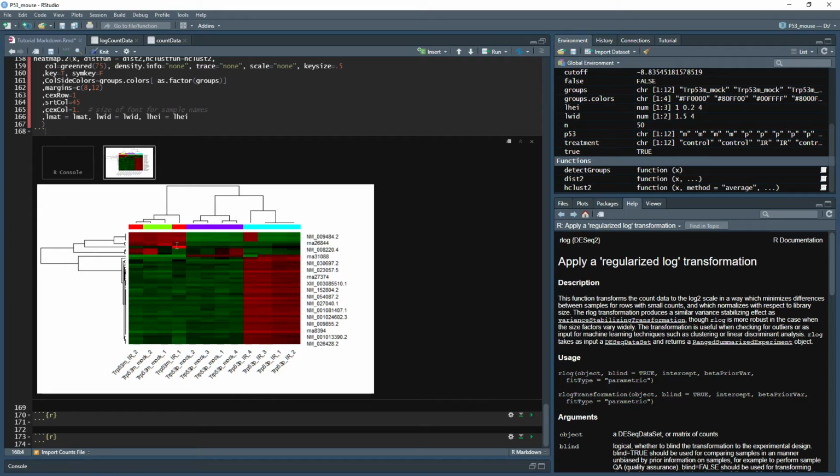And that could be something like apoptosis, downstream cell death signaling that it just can't control anymore, or lack thereof. Whereas here seems pretty mild, down expressed in comparison to over here, where there's a lot of genes being upregulated from the radiation while P53 is present.